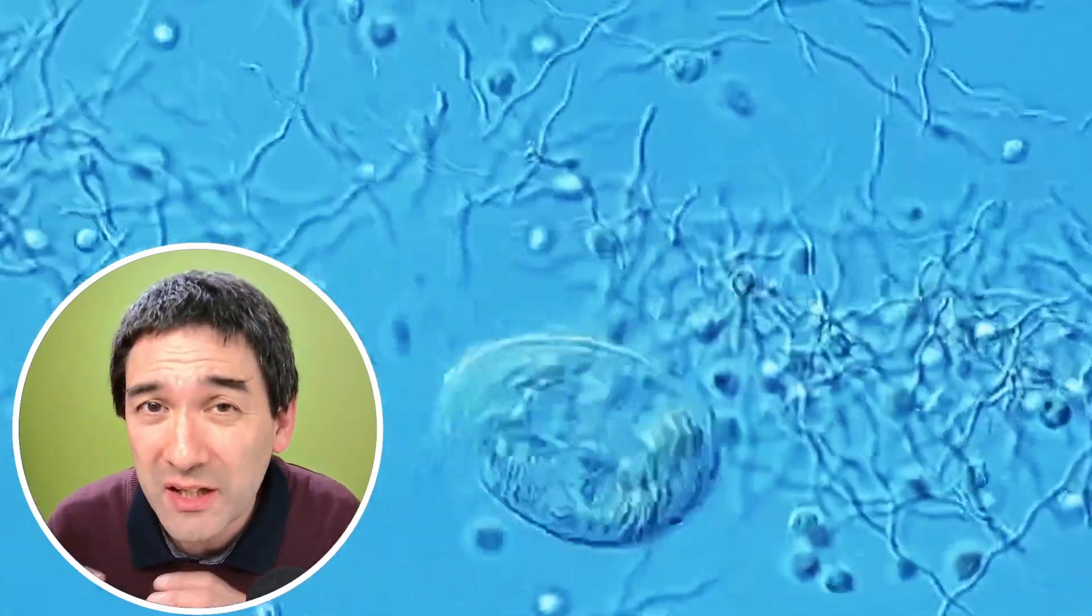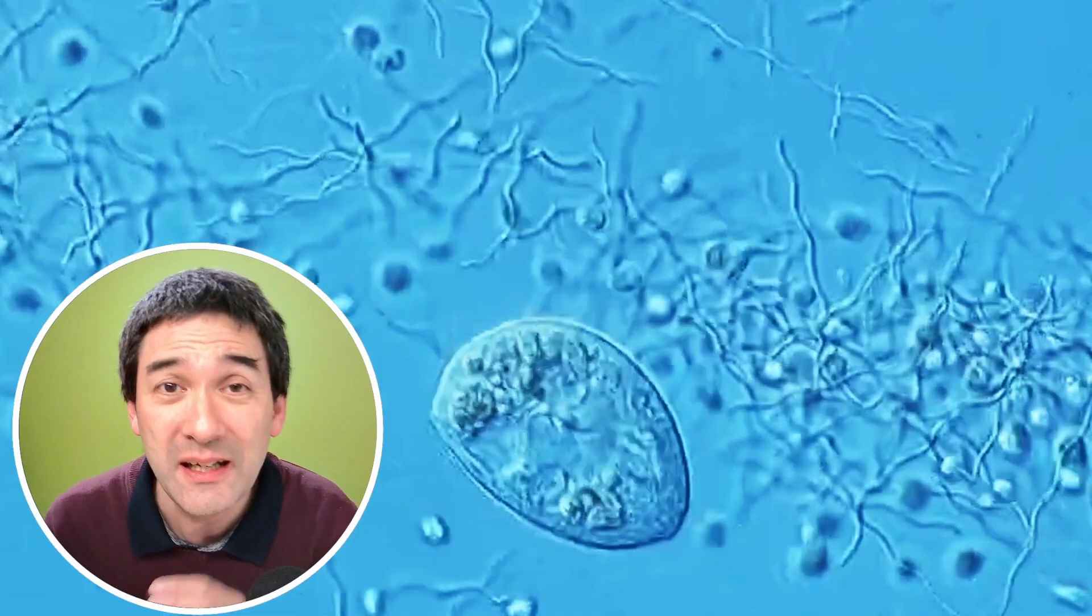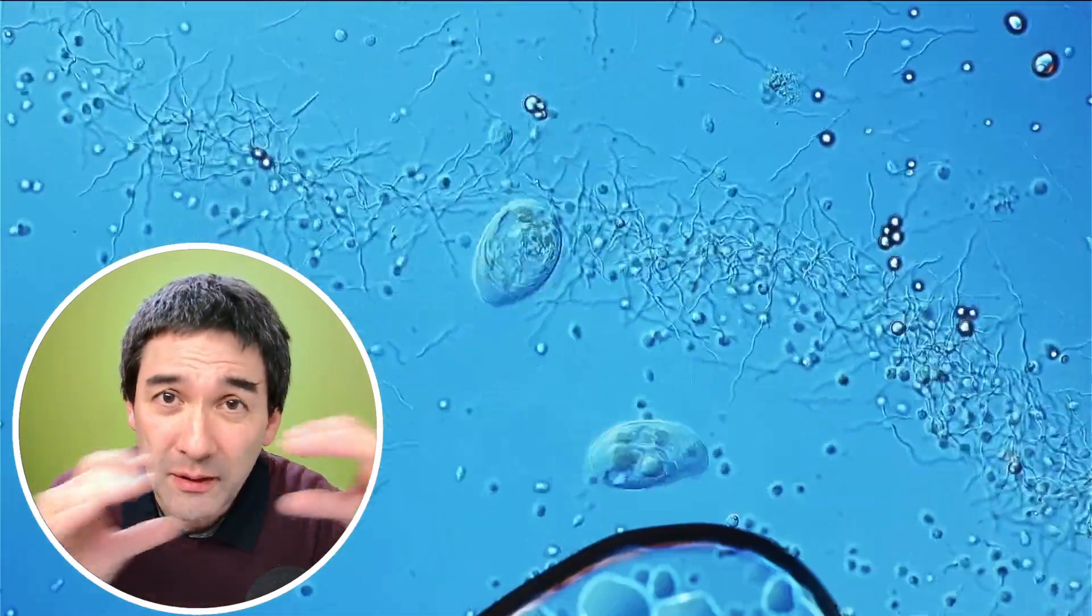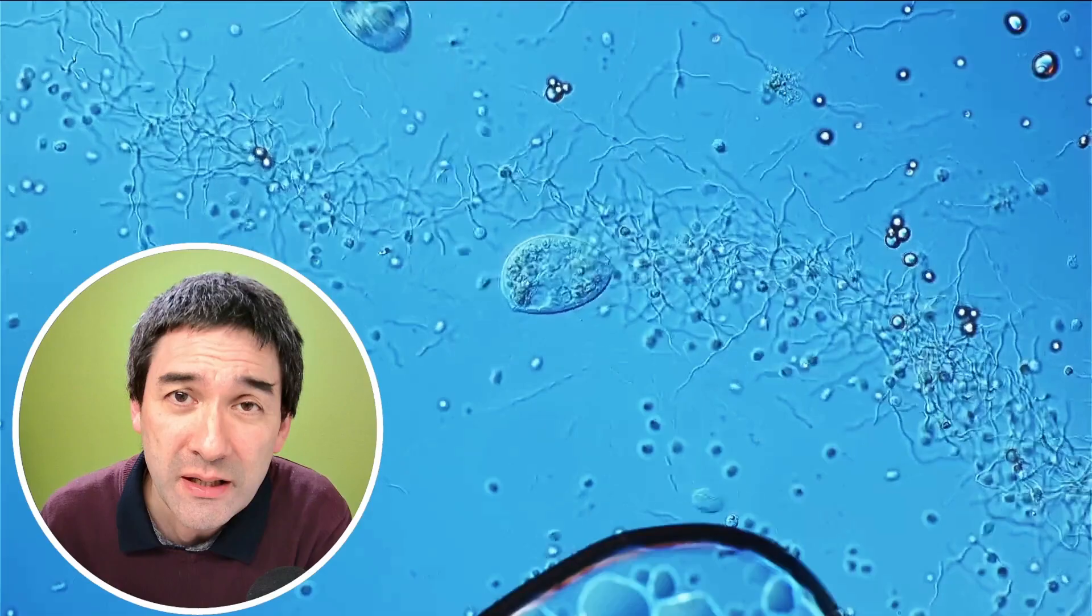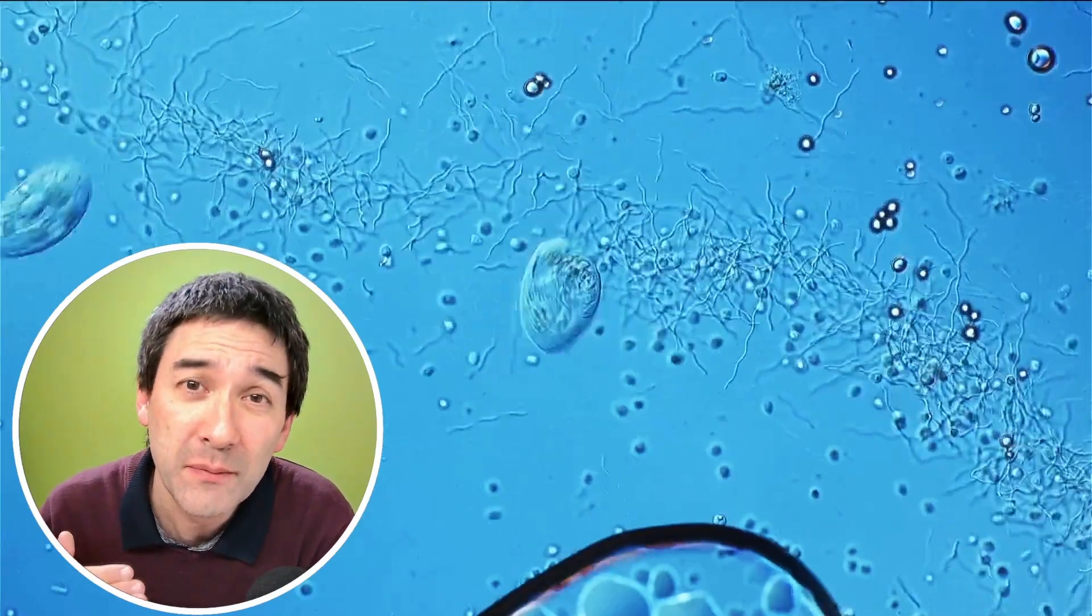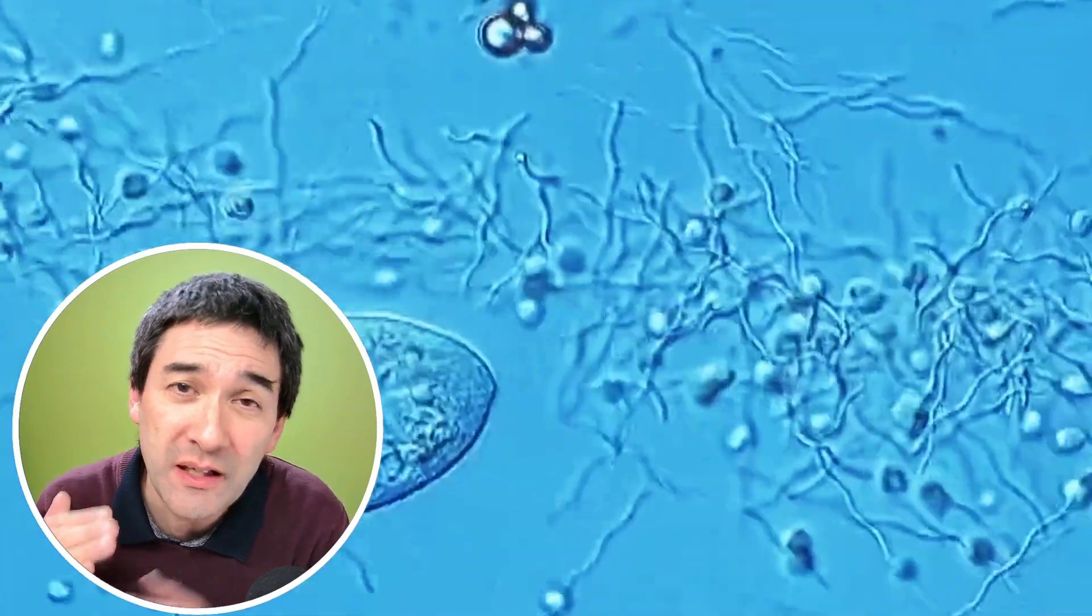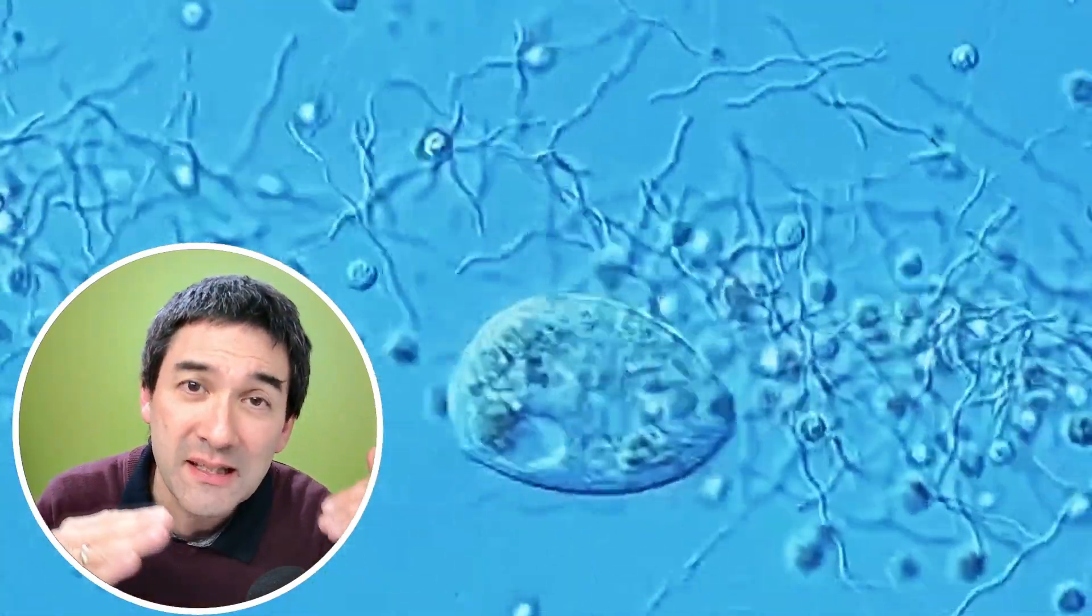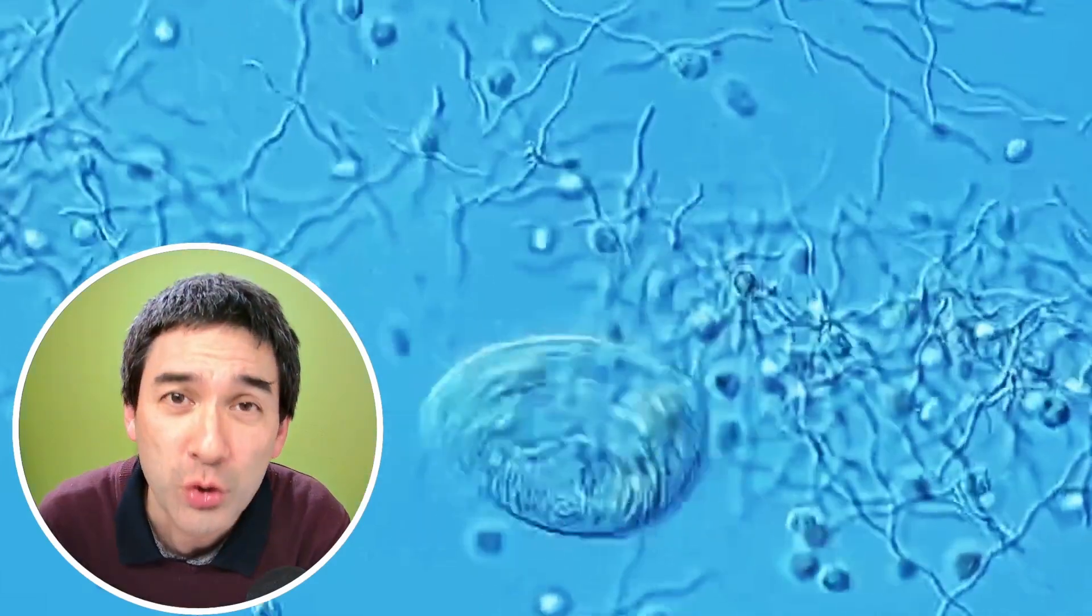Now you might have noticed that those bacteria and also those ciliates, they like to gather around in a strip right through the center of the field of view. And this actually is quite common when there is a concentration gradient of oxygen. So essentially what they do is those bacteria will sometimes actually move along the slide towards an area of higher oxygen concentration.